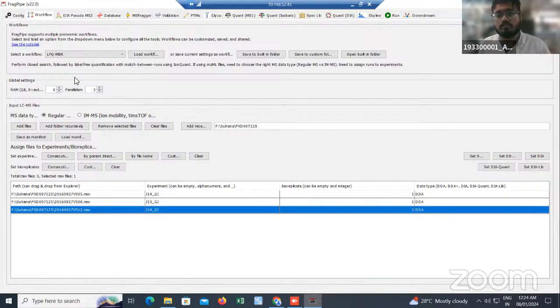You have seen that you digest proteins into peptides and then inject them into the mass spectrometer. That is bottom-up proteomics. So here is the software, one of the tools which helps us understand the chromatogram and identify what those peptides are. This is one of the software, FragPipe.